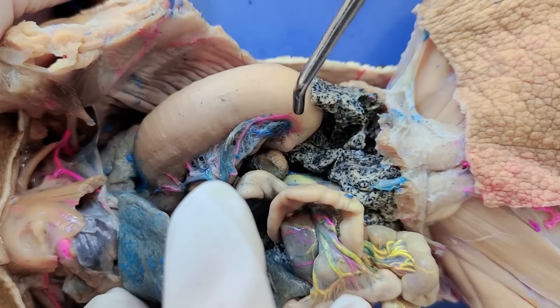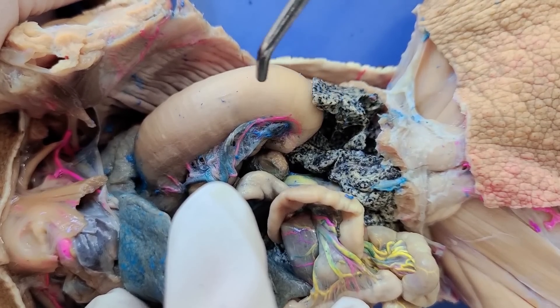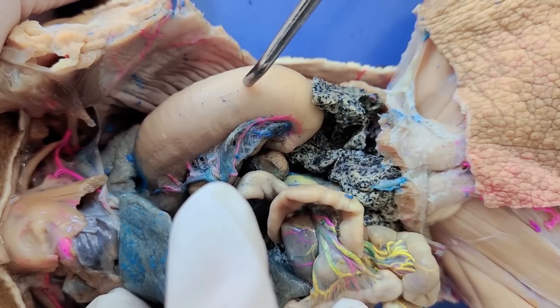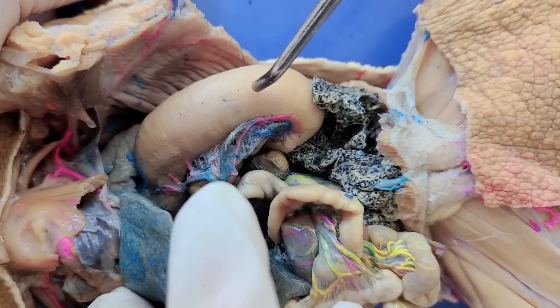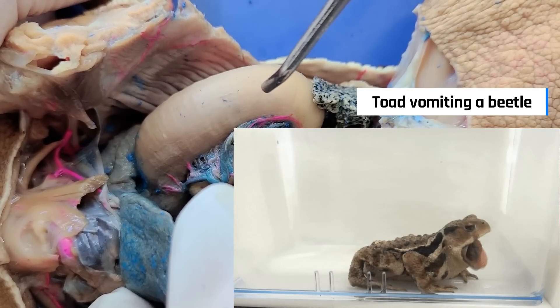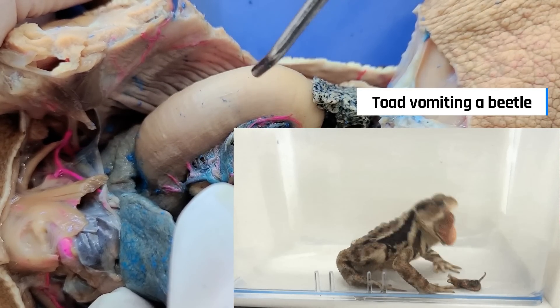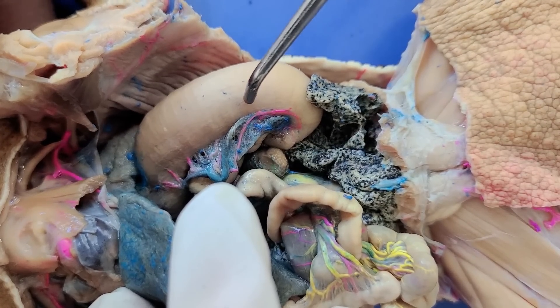Toads can't really vomit like we do. So when they want to spit out something unpleasant in their stomach, they literally turn their stomach inside out and dangle it out of their mouth — it's kind of like emptying a bag by pushing its bottom up to the top. But when it's not vomiting, the stomach functions in mechanical and chemical digestion.